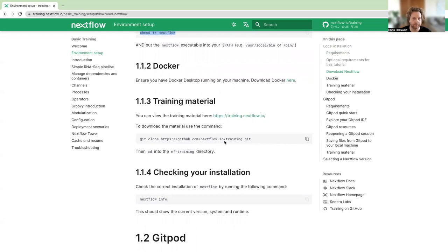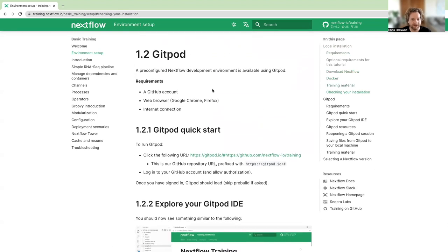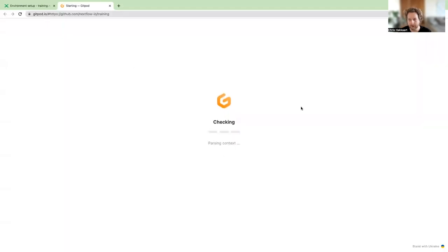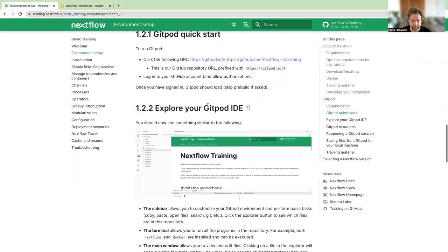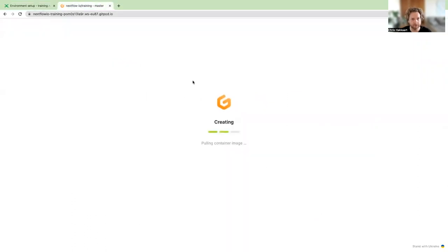I do really recommend that you use Gitpod. You can quickly access the Gitpod environment by following the link under section 1.2.1. If you click on that, it should create a new Gitpod environment. If this is the first time you're using Gitpod, you might need to authenticate your account using your GitHub credentials, and it may take a little bit longer for everything to load.